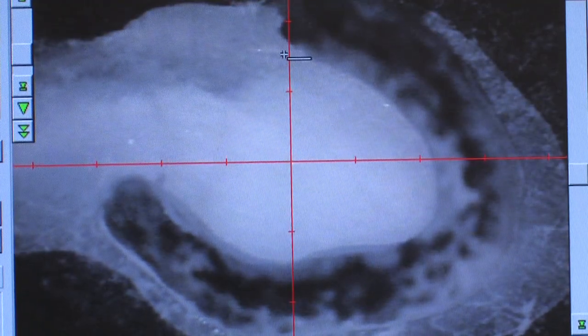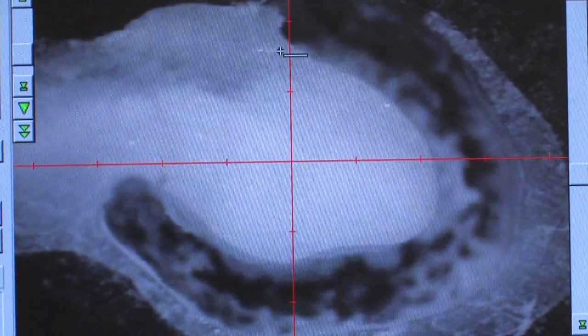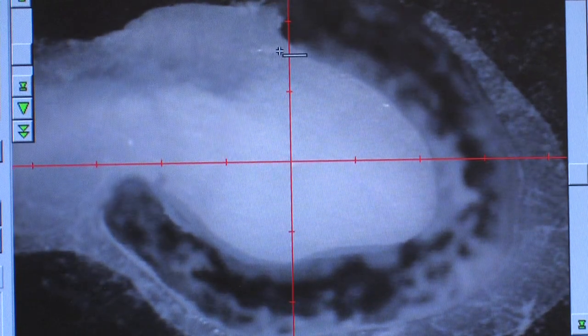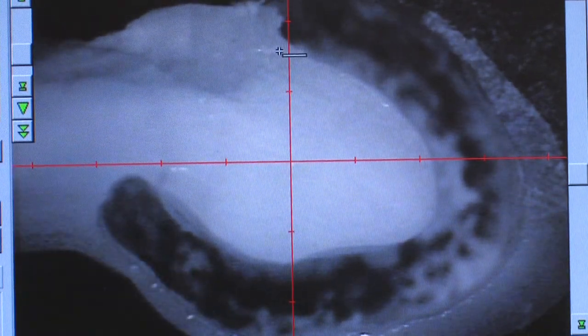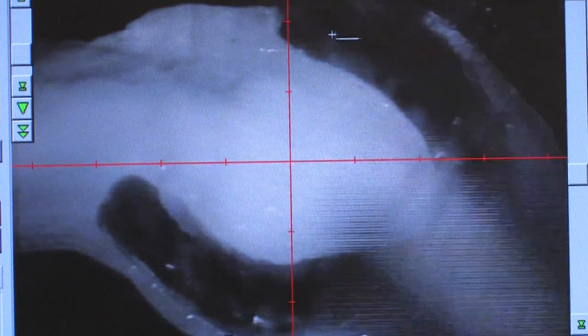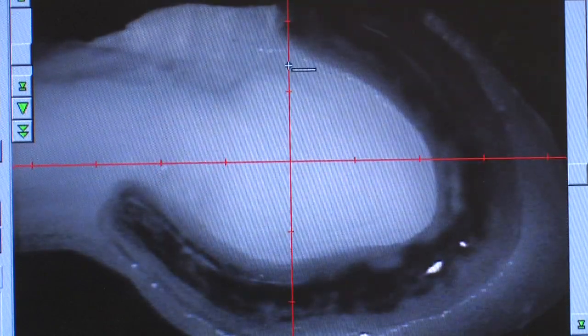Once this is completed, determine the area or annulus you wish to sample and mark it with a new line using the line tool. Adding a few drops of ethanol from a syringe to the surface of the otolith helps to see the individual annuli more clearly.